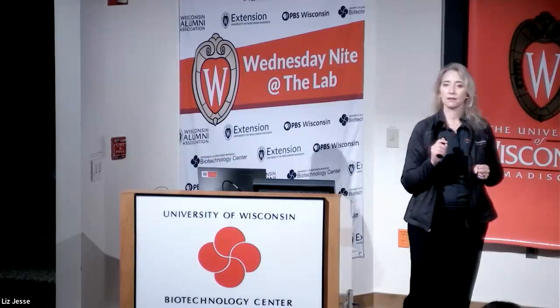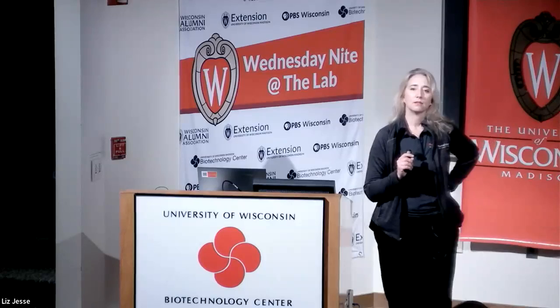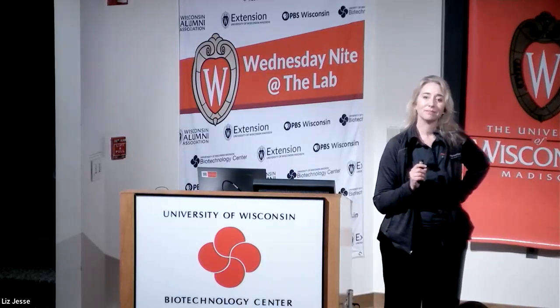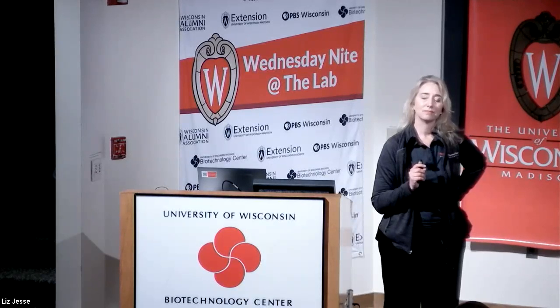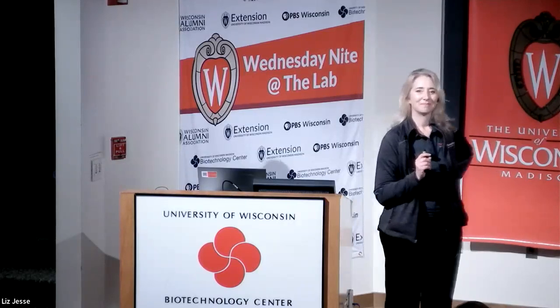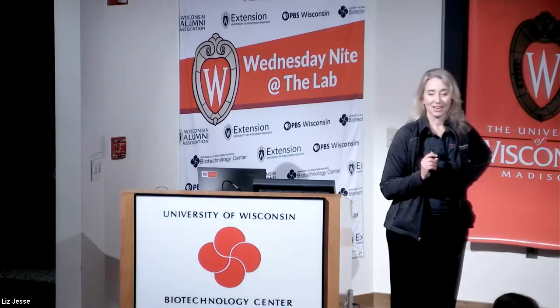Yeah. So I just wanted to ask, you mentioned the 4-color capability of the machine. Can I have different genes of interest or different primers tagged with different colors and load them into a single well to get the expression of all 4 of them simultaneously, without the fear of overlapping activity or anything like that? That is correct.